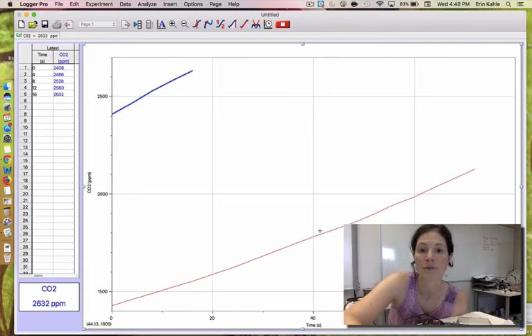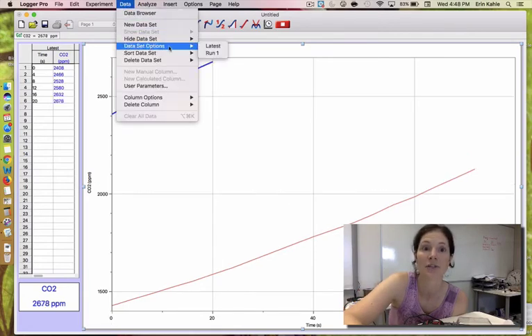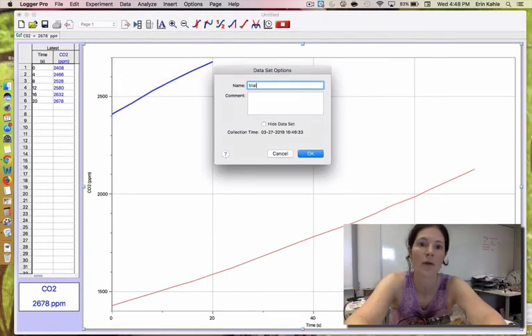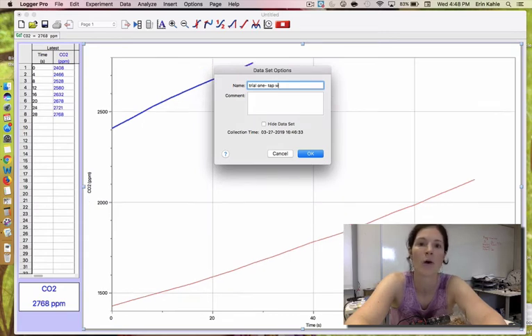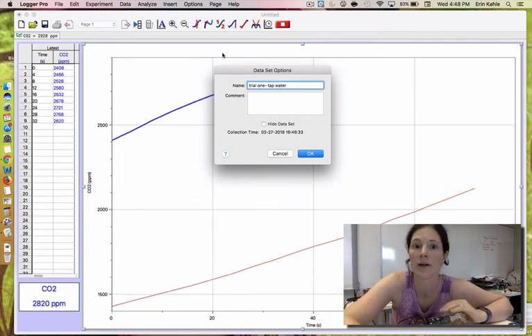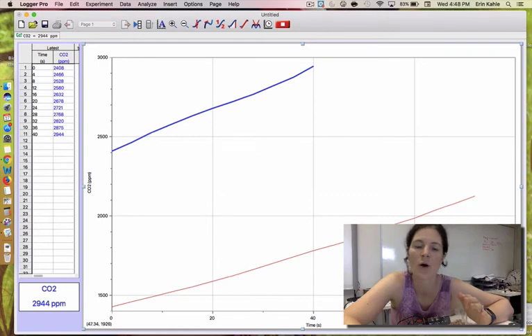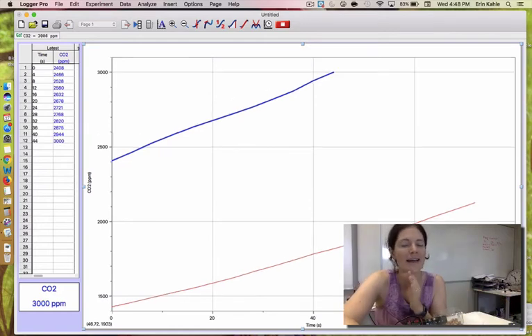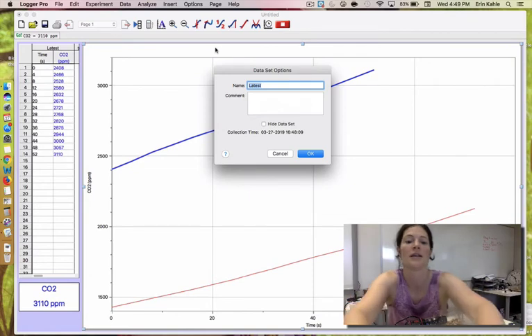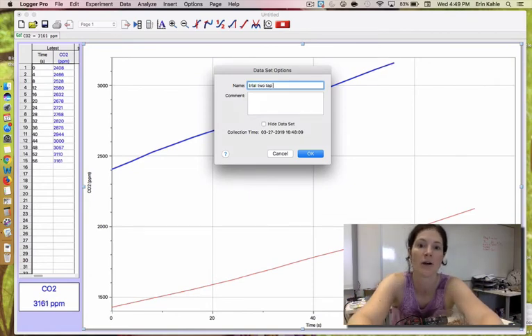It's easier for you if you collect them all in the same graph. So for that first run, I'm going to say data set options, and I'm going to name that run 1. Maybe I'll call that trial 1 in tap water, whatever your independent variable is, like what salt concentration or what temperature. So now whenever I analyze that, it will tell me that it's tap water. I don't have to remember the red line's tap water, so label your data, right? So data set options, and I might say this latest one is trial 2 in tap water.